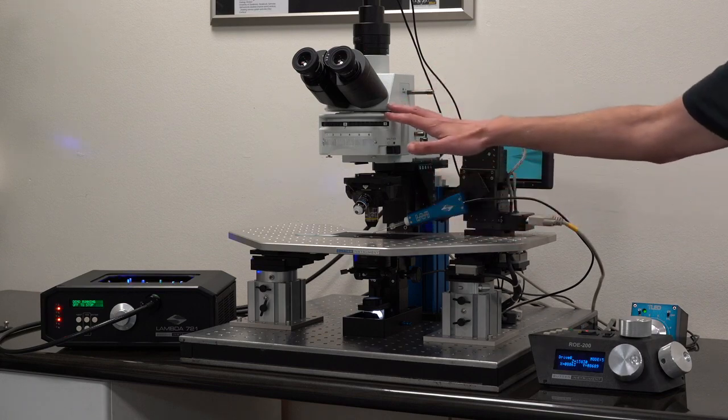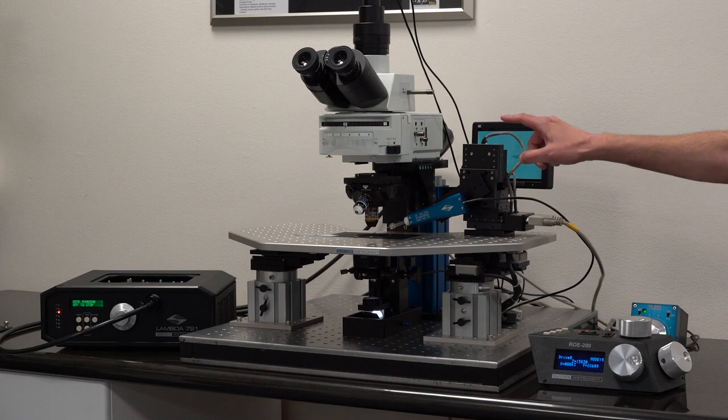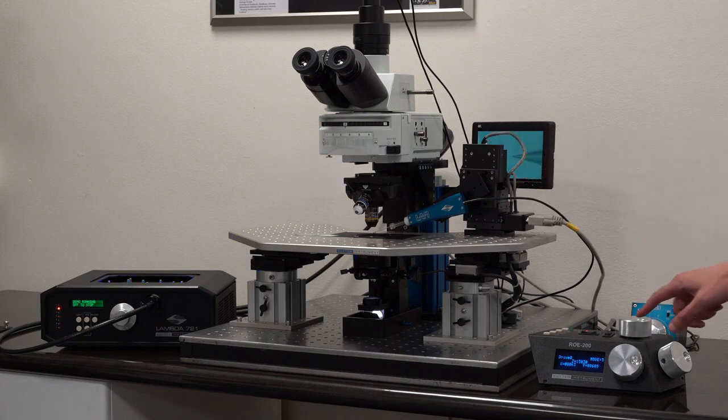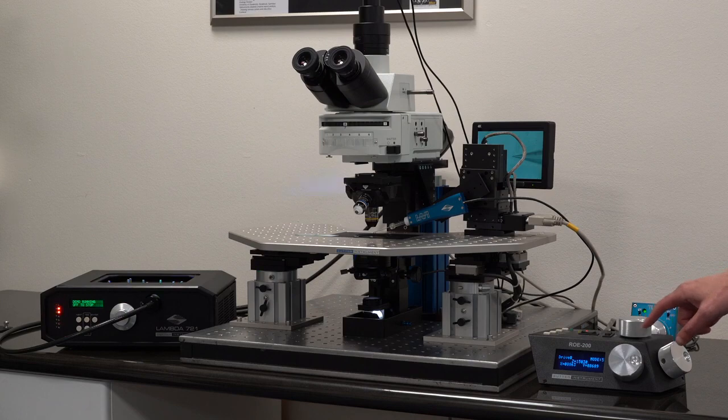Both the stage, the Z-focus of the microscope, and this manipulator are attached to an MPC-200. And they are both operated with one ROE on the tabletop.